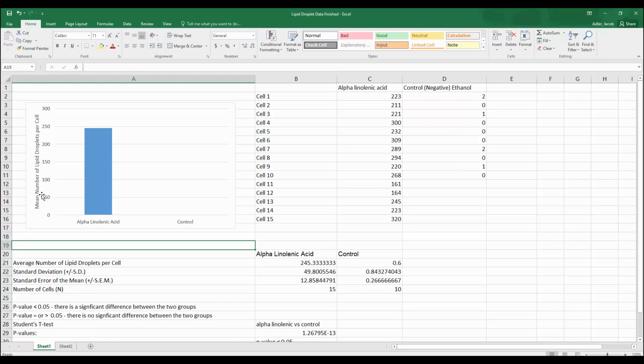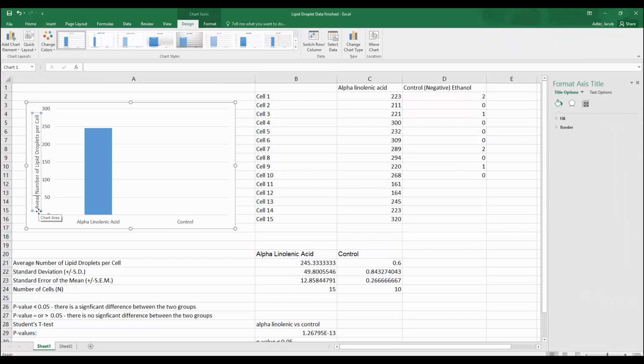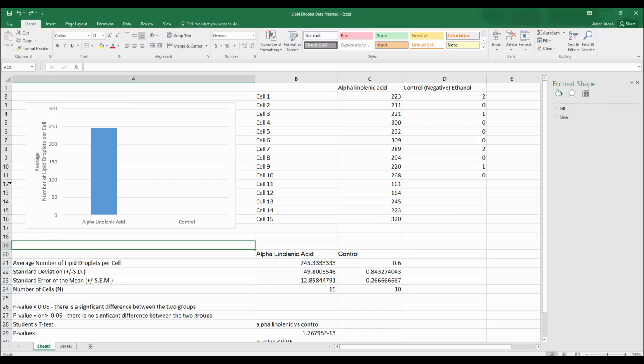So there's a couple different ways you can do that. I prefer average. I don't know why. I just look at it and I'm like, I've got to change that. And then you can mess with the size and make it look appropriate for the image itself. So there's a couple different ways you can do that.